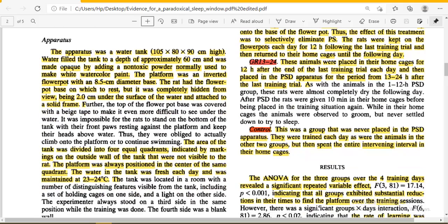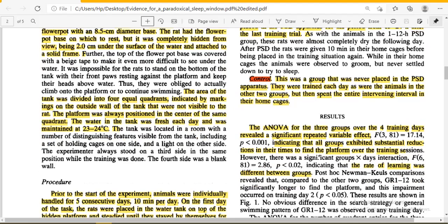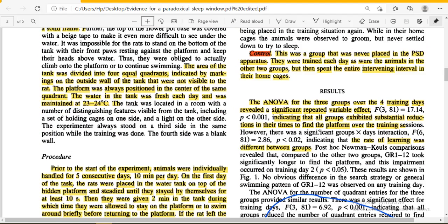Due to the lack of visibility, rats had to locate the exact location of the flower pot using their spatial memory. The tank area was divided into four equal quadrants, indicated by markings on the side walls not visible to the rats. The platform was always positioned in the center. The water in the tank was changed fresh each day, maintained at 23 to 24 degrees centigrade.